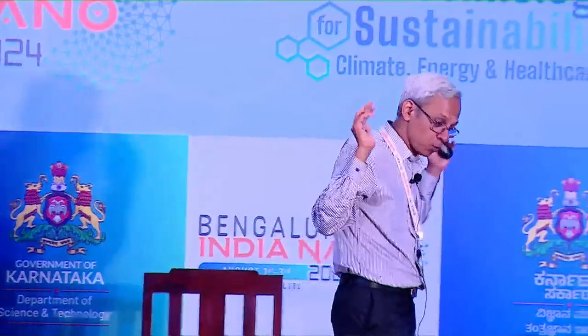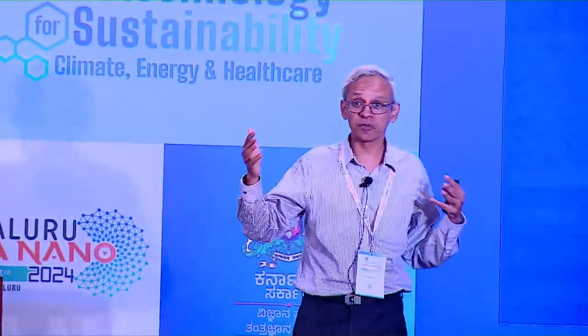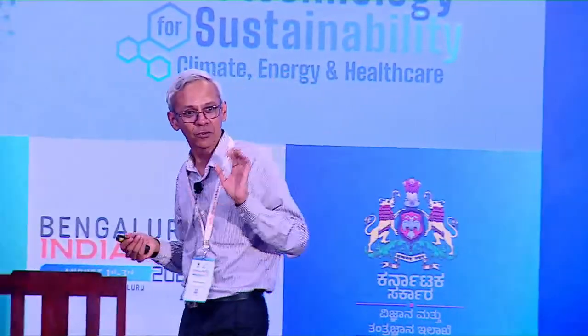So you need to be representative. You have to look at multiple specimens, many different regions. Only then can you say what your specimen contains. You cannot just look at one region and find something interesting. Okay, let me write, so anyway, you should be very careful about the representative part.